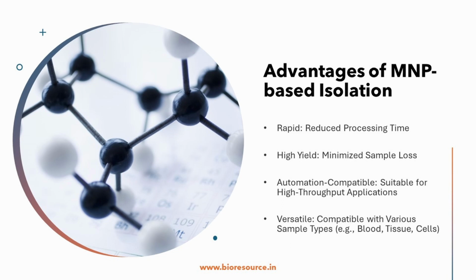The magnetic nanoparticle isolation can yield highly purified nucleic acid with minimal contamination. This is another advantage, that the purity of the isolated nucleic acids is much higher compared to other methods, and it is very much scalable. The technique can be easily scaled up or down to handle different sample volumes, and it is very safe compared to other methods that use harsh organic solvents. MNP isolation offers a safer alternative.